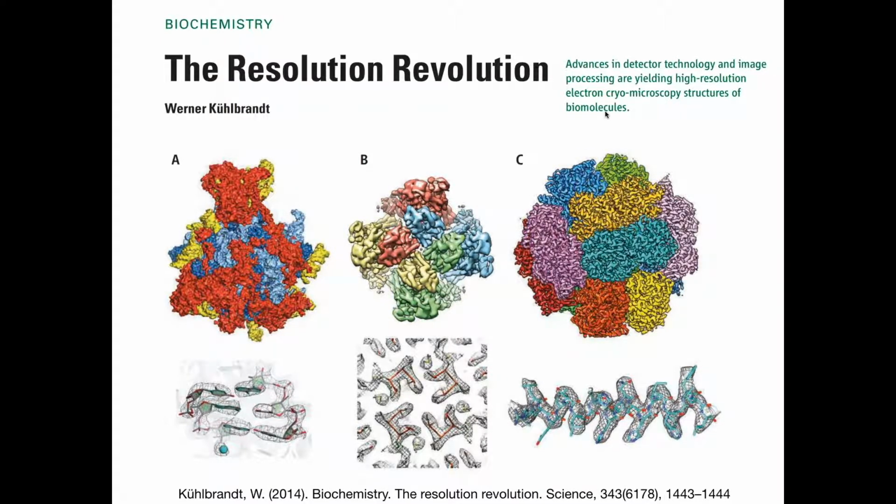So this led to what became known as the resolution revolution. Now, I would argue that perhaps it wasn't a revolution per se. There were very many developments from different corners and different areas of the field, all of which culminated in people paying more attention. And once people started paying more attention, they realized that this technique could really be used to understand interesting questions in structural biology.